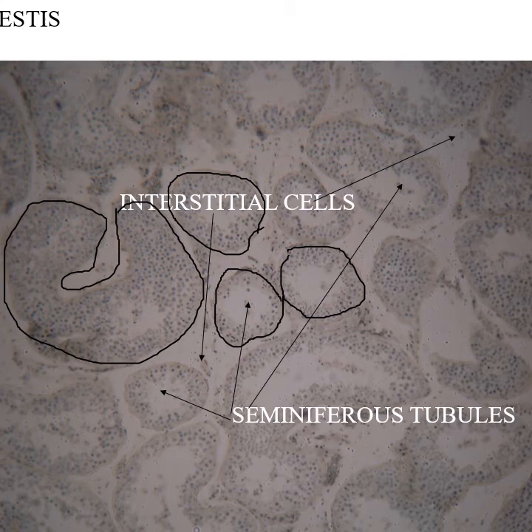But then you've got some groups of cells, like right here, there's a few. See those little black dots? And you've got a few right here, some little black dots right there. The cells that are not part of the seminiferous tubules, they call them interstitial cells or cells of Leydig. They're the endocrine cells. They produce the testosterone.